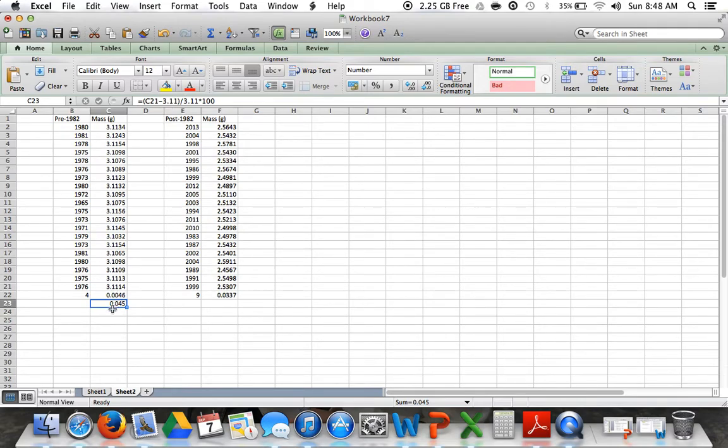But, guys, this is our percent value. So technically you should be around that. All right? Now, if you're at like 1%, don't worry. You know, that could be a calibration thing with the scales. Could be a lot of things. All right, so now I'm going to click and drag this all the way over again. Delete these because this doesn't matter.